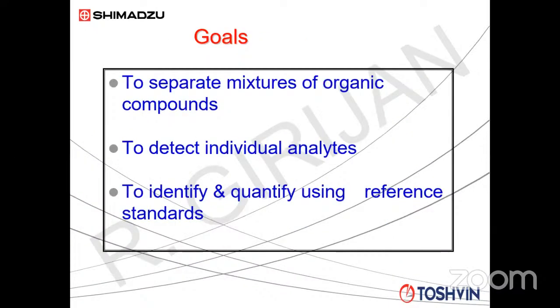Now coming back to gas chromatography, that is gas phase chromatography, what are the goals of carrying this out? To separate mixtures of organic compounds. But sometimes when I say this, it can be slightly misleading for the customers. Then they ask whether inorganic compounds cannot be separated by GC. To answer that question, first of all, we need to understand that gas chromatography is a technique for volatile compounds.